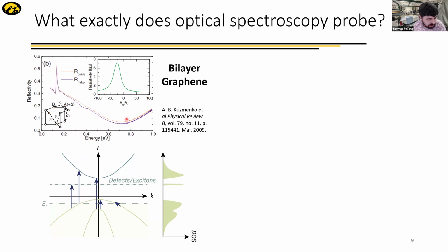So in this case, this spectrum was probably acquired with a spectral resolution of around 0.1 meV, but it's actually easy to measure FTIR spectra, these infrared spectra, with a resolution of, say, microelectron volts, relatively straightforward. So we get excellent energy resolution, but sometimes we have to figure out what transition we're actually seeing.